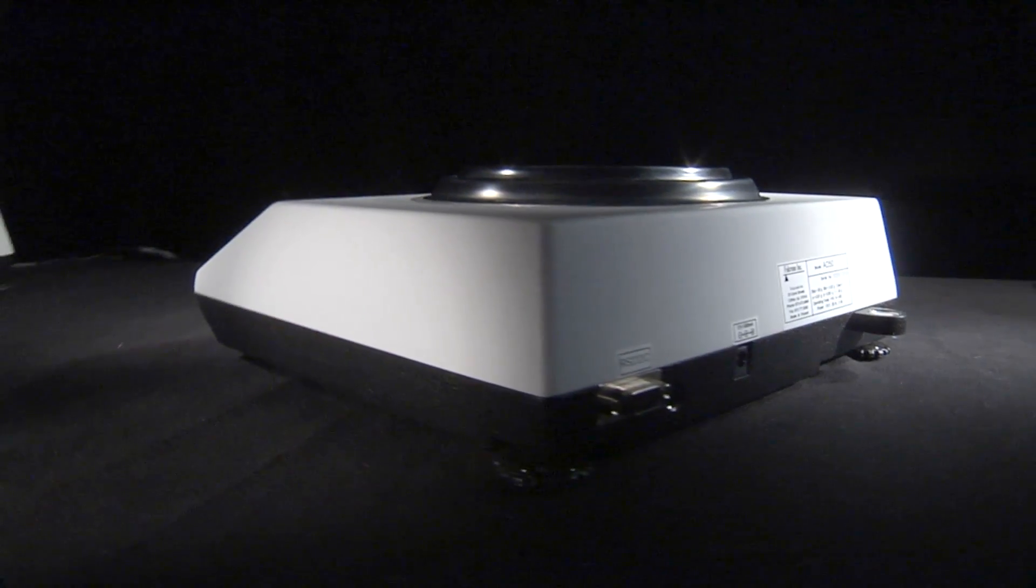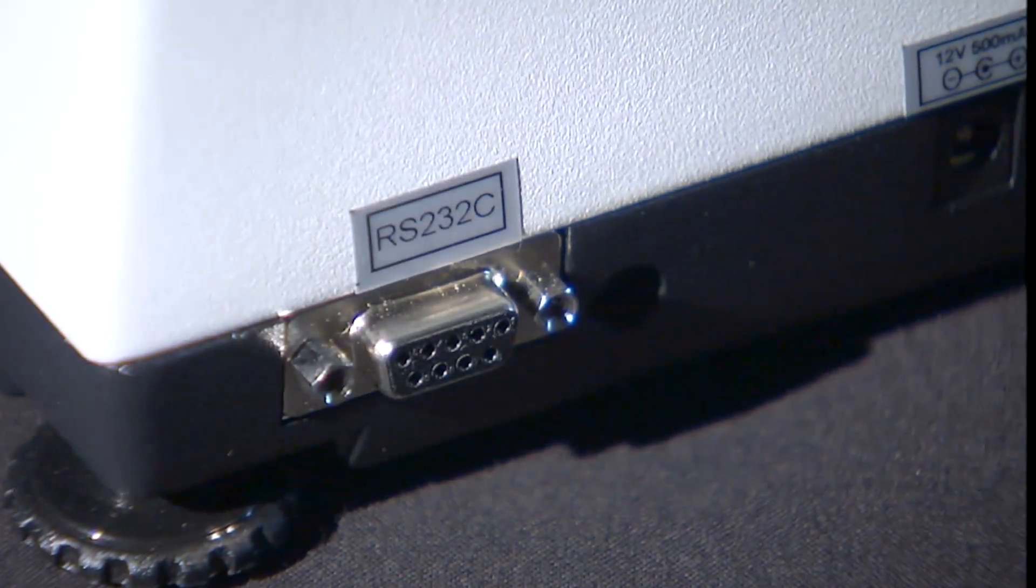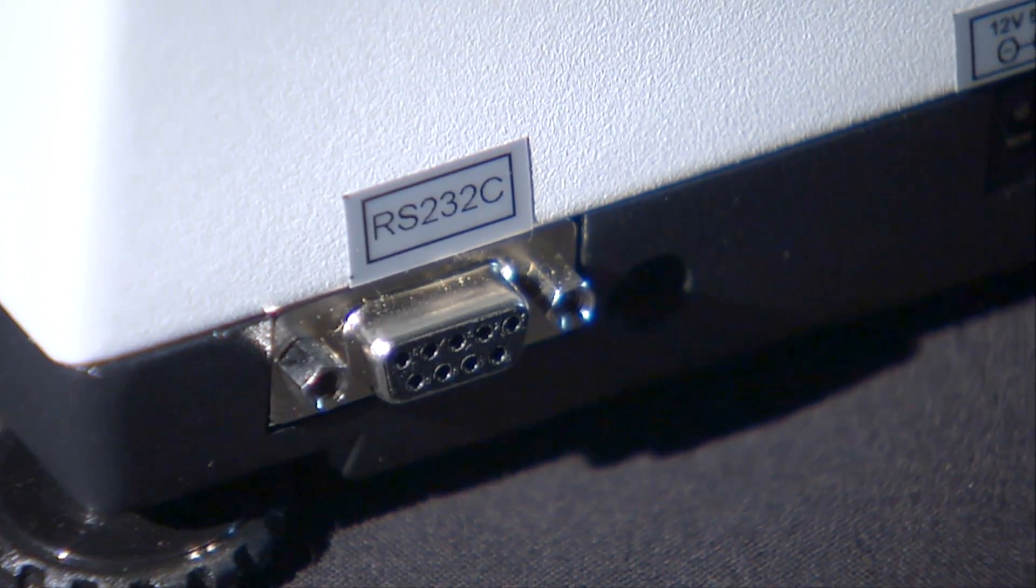A programmable RS-232 communication port is standard on all scales. The port allows transferring data to a printer or a PC.